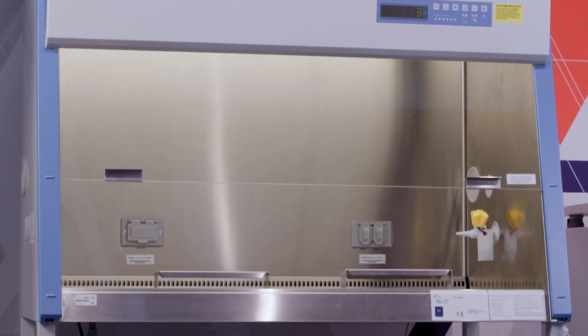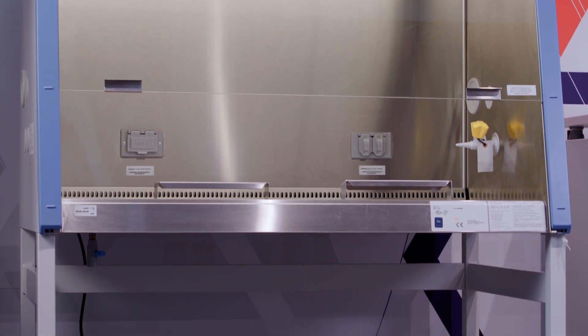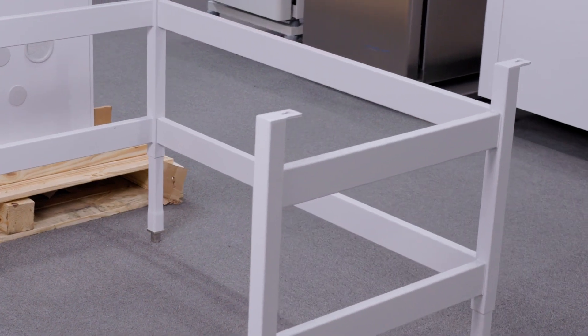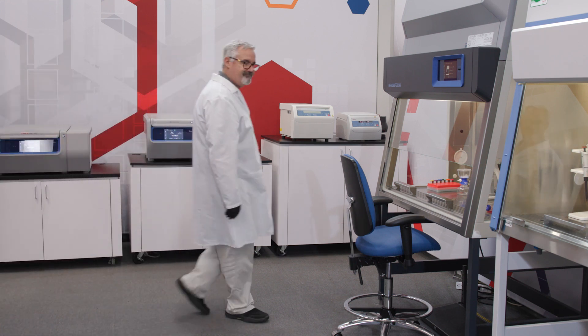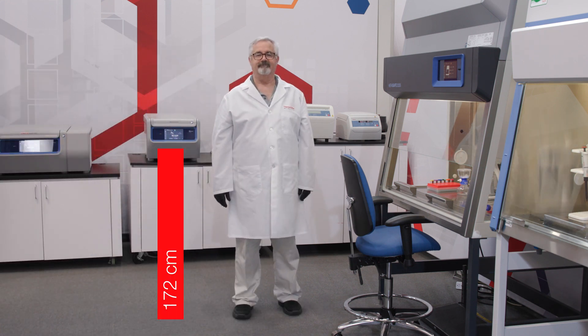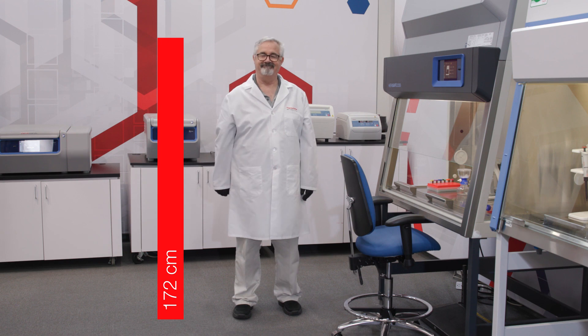There are fixed-height, electric, and caster stands for BSCs. Most common is height adjustable at installation. Worldwide, the average adult height is 167 centimeters. Dave here is about 172 centimeters.